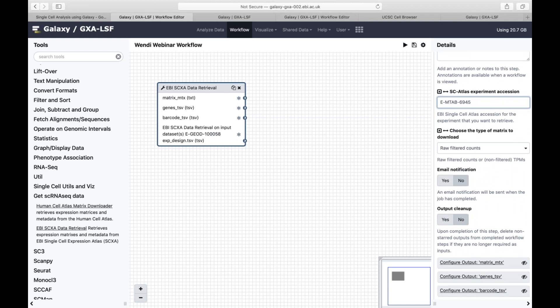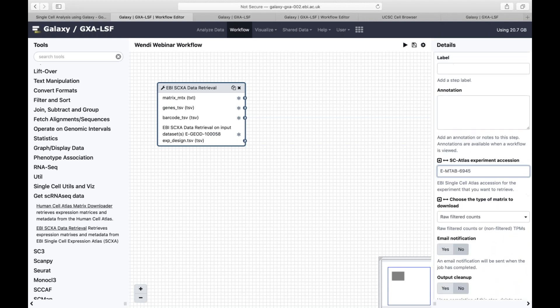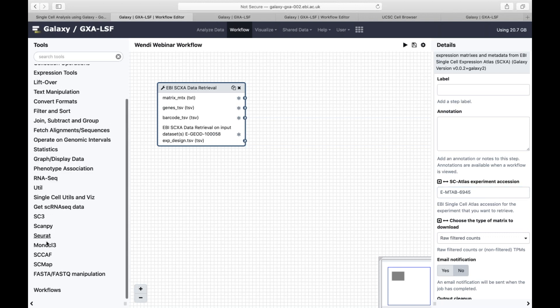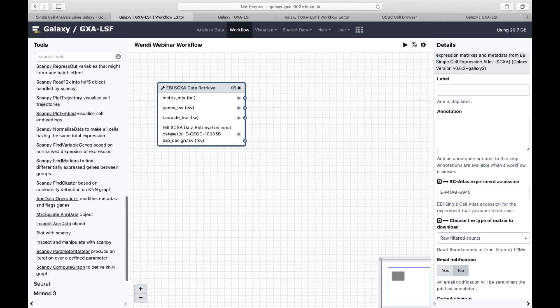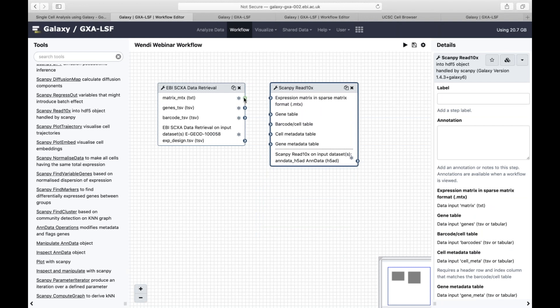For each of the tools you can set different parameters or options. A lot of the time, especially if you're a wet lab person, you'll just leave it at the default setting. But important things include which experiment you're accessing — that's the accession number from the Expression Atlas. Now I need to actually start analyzing my data. This will pull the data across, and the first thing we need to do is read this data in — it's very similar to 10x data, it's actually Drop-seq data.